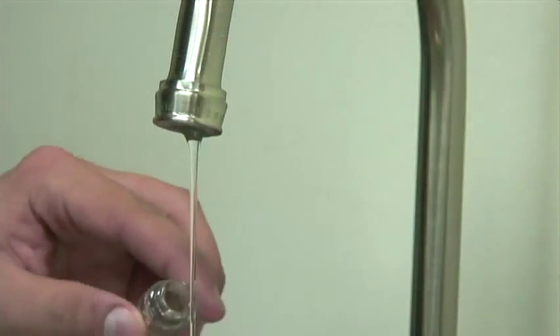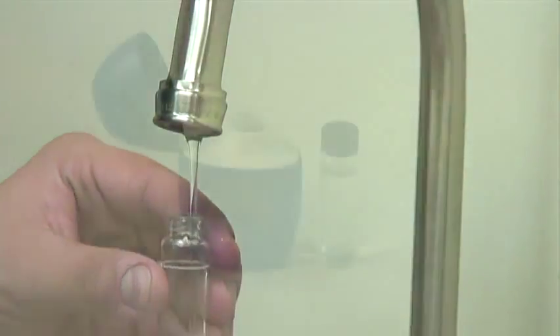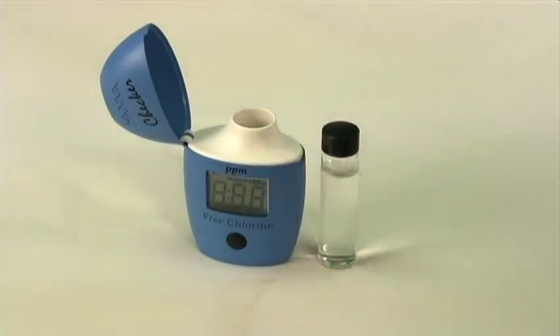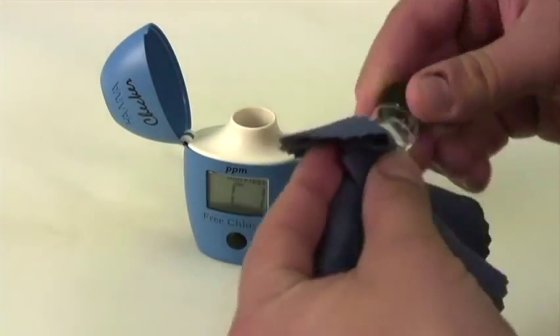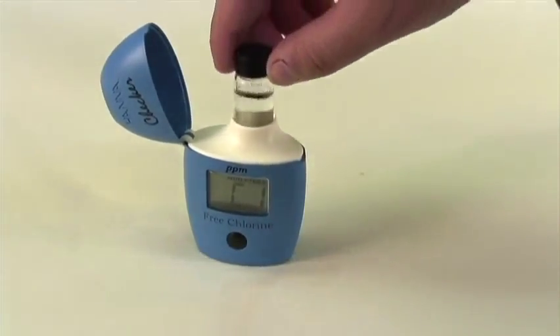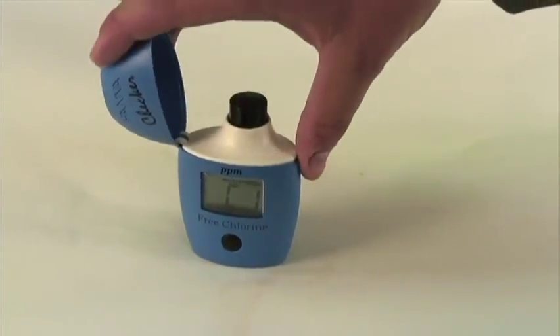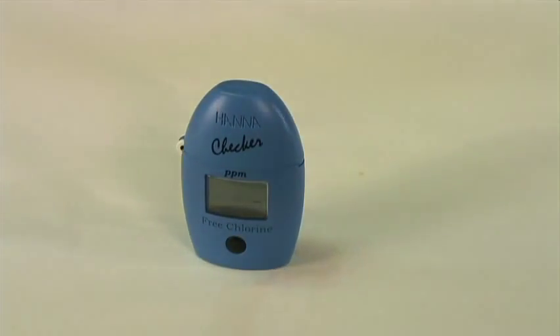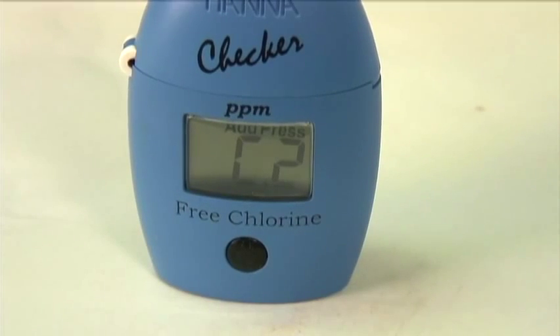Now we're going to fill up the cuvettes at the sink. The first step in our measurement is to zero out the meter, so we're going to first turn it on. Now we're going to clean off the cuvette, index it within the meter itself, and close the lid. Pressing the button once will begin the process of zeroing the meter. And as you can see, now it says C2.